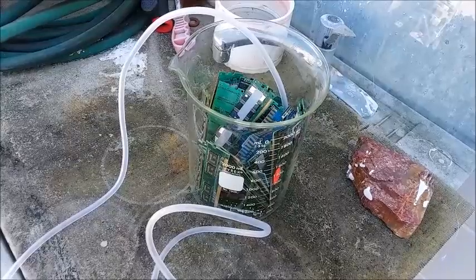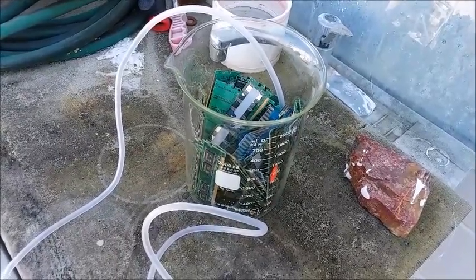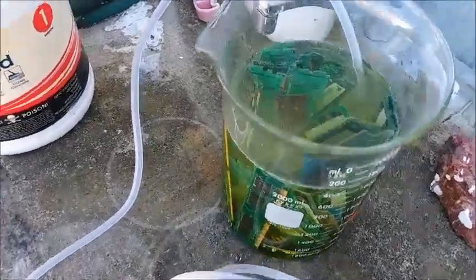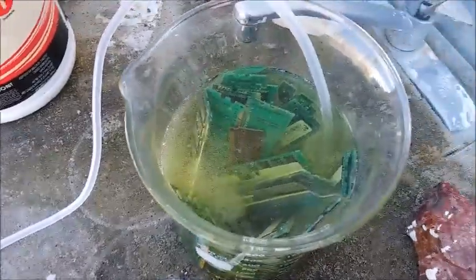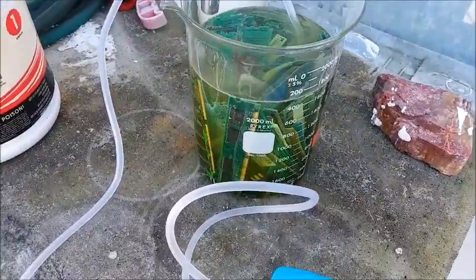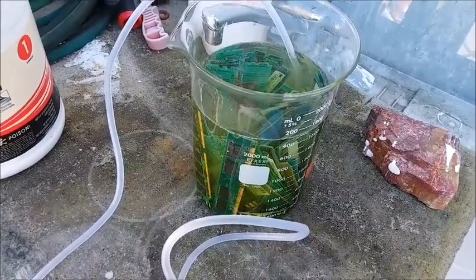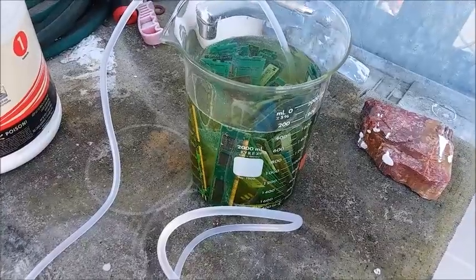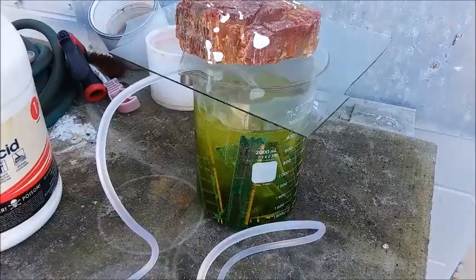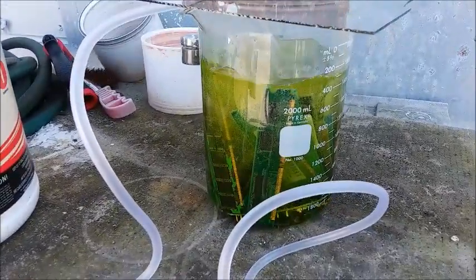I'll fill it up with the chemicals and start it going and we'll leave it sit for another week and see how it goes. The chemicals are in and there's an immediate reaction just like last time, so it's starting up already. I've got the pump plugged in and it covered with glass. I don't know if you can hear the pump running, but it's going - it's bubbling.